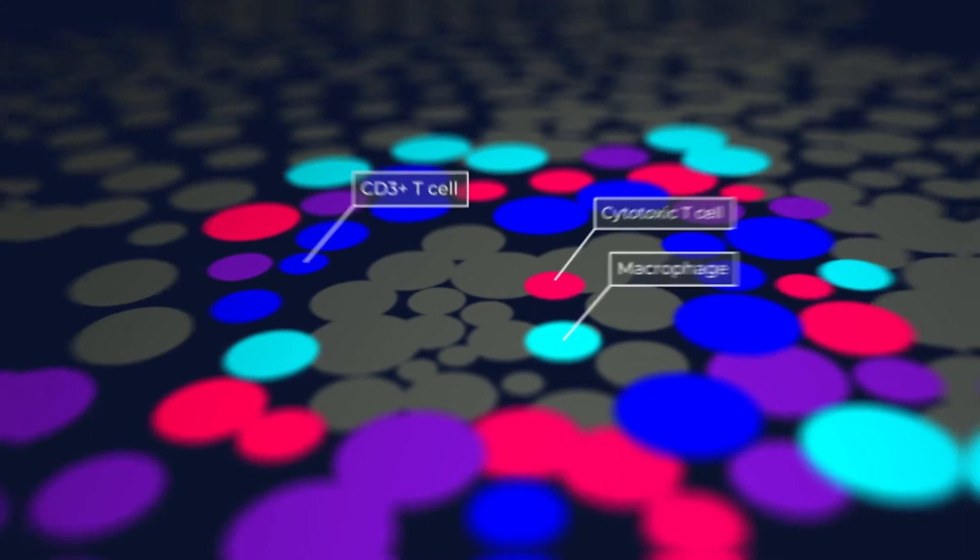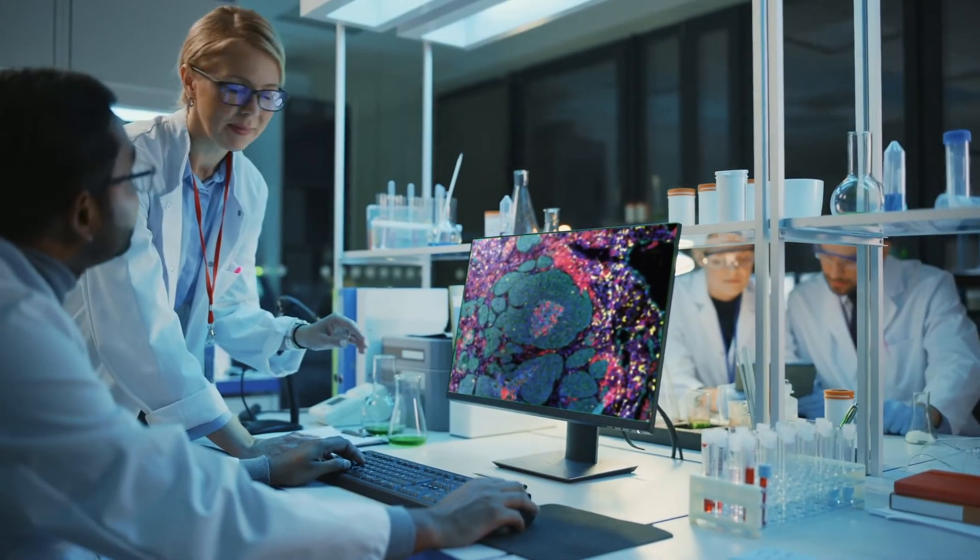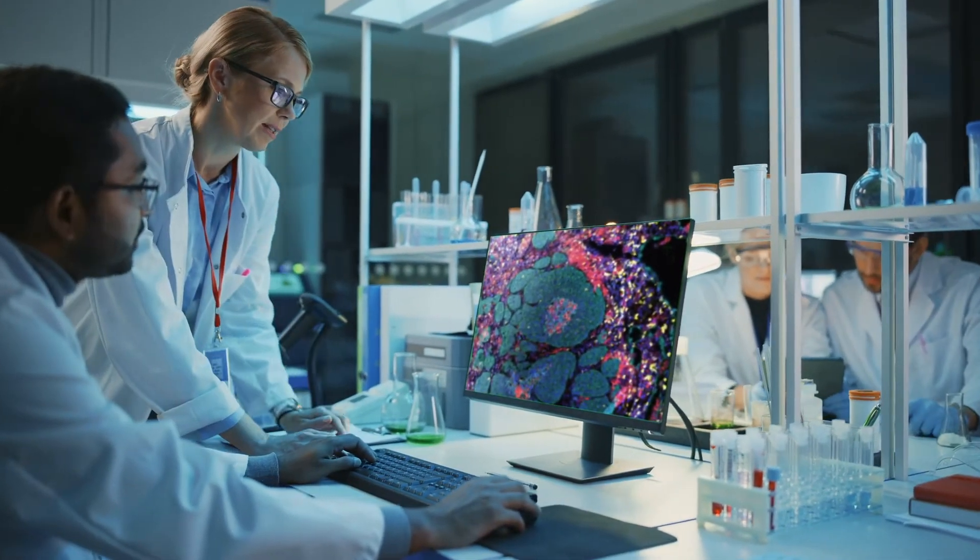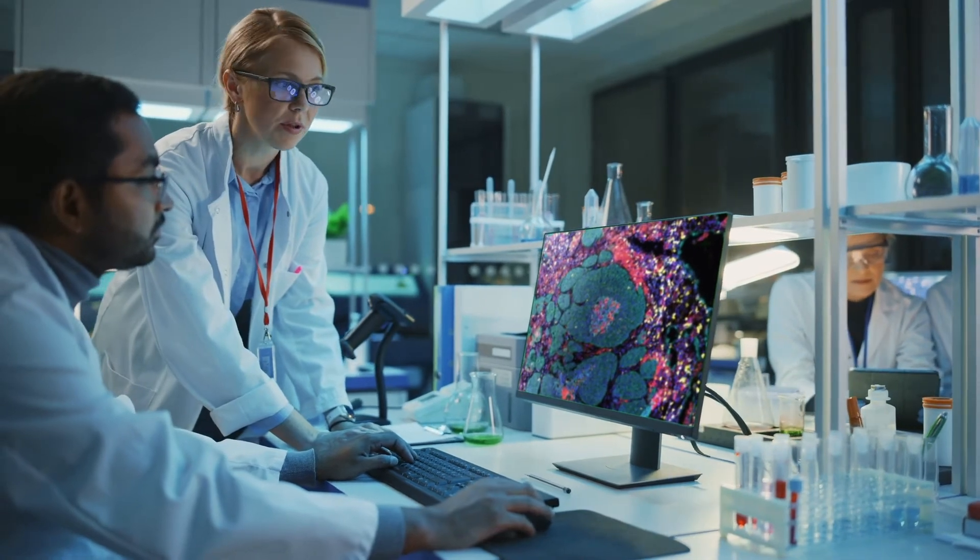At Akoya Biosciences, we've built spatial phenotyping solutions to help you answer all these questions and more.